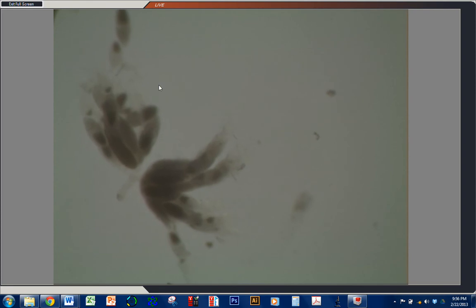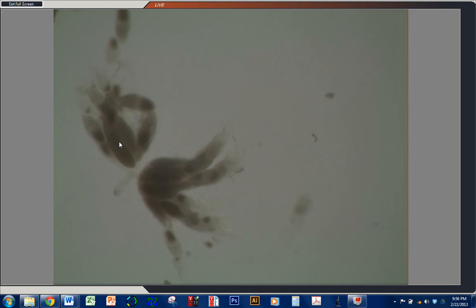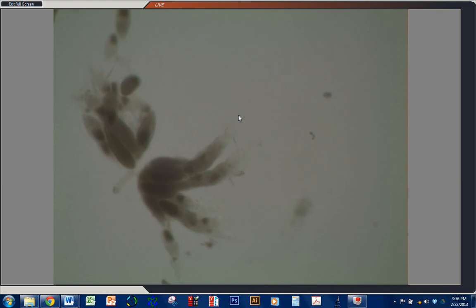I'm going to focus down just a little bit so you can see them better. So, we take our pointer here. These are individual egg chambers. There's a more mature egg. And it's hard to see in this video, but out here at the tip is the germarium where oogenesis begins.